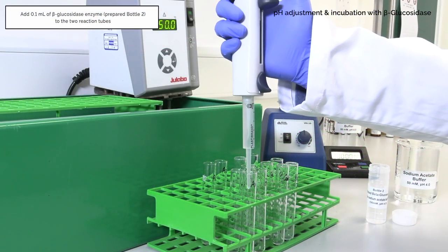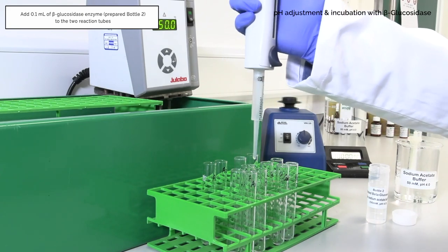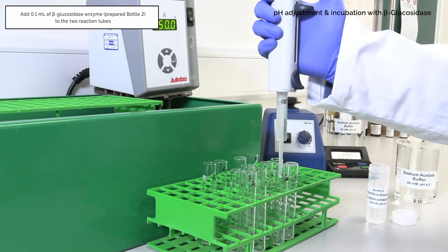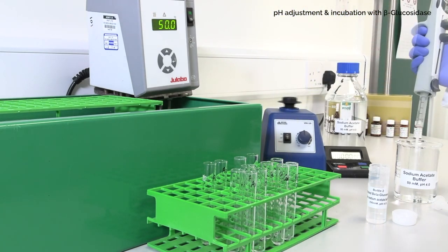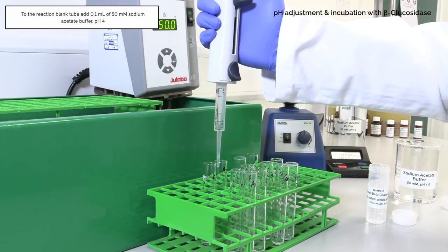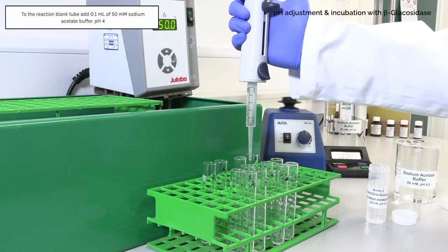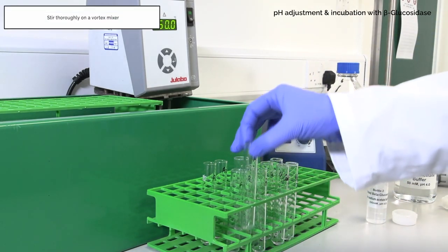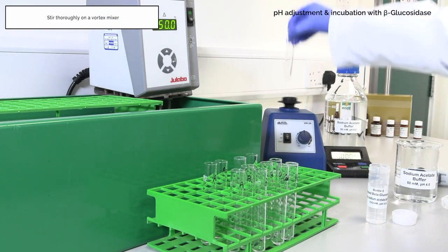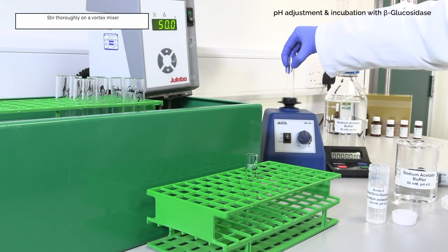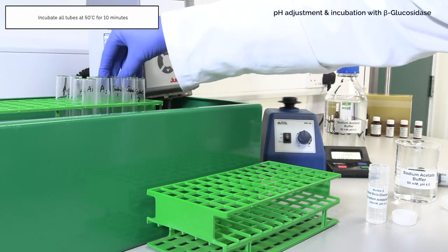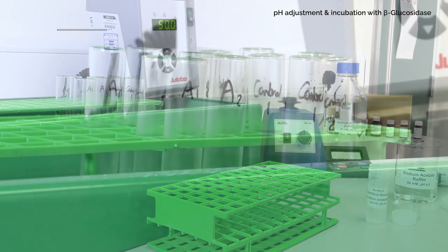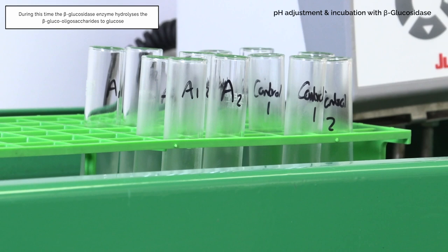Add 0.1 milliliters of beta-glucosidase enzyme, prepared bottle 2, to the two reaction tubes. To the reaction blank tube, add 0.1 milliliters of 50 millimolar sodium acetate buffer pH 4. Stir thoroughly on a vortex mixer. Incubate all tubes at 50 degrees Celsius for 10 minutes. During this time, the beta-glucosidase enzyme hydrolyzes the beta-glucosaccharides to glucose.